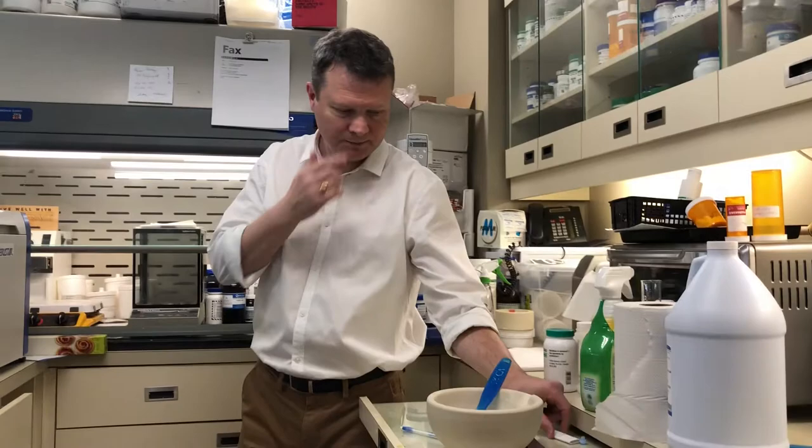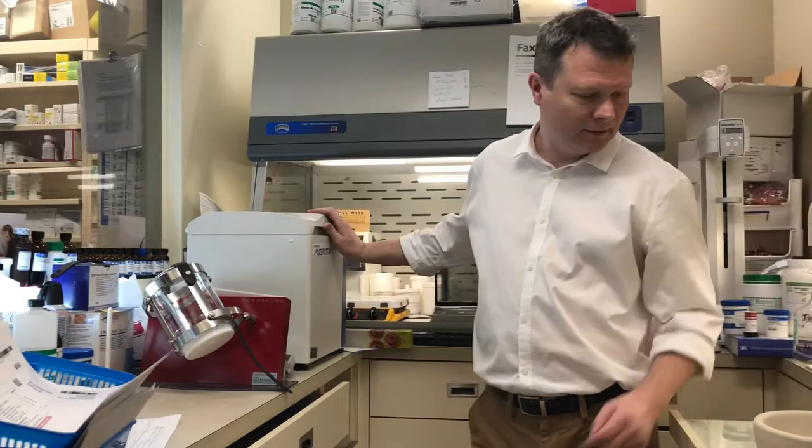Okay, so that spinning is done. I'll let this wind down and we'll have a look at what this looks like.